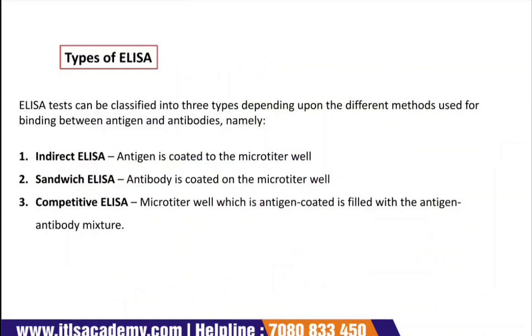It is particularly beneficial for detecting food contaminants, meaning how it is used in the food industry. Because of this, it is beneficial for detecting food contaminants, and widely used in food safety labs for monitoring hygiene and detecting pathogens in a complex food matrix.